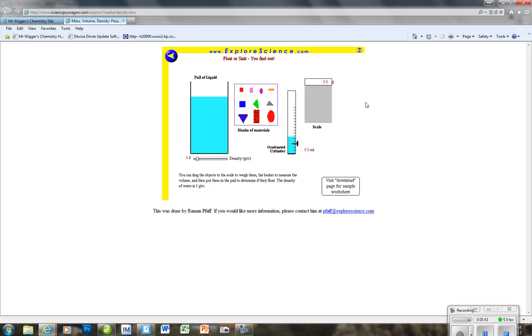First of all, I'm going to just do a couple for you so you can see and get the feel for how this actually works. I'm going to take this red square and put it over here on the scale. You'll see right here that we have a mass of that little red square of 19.5.